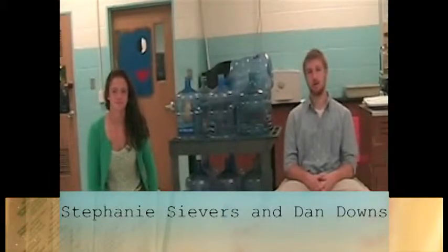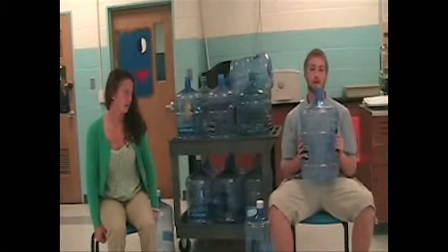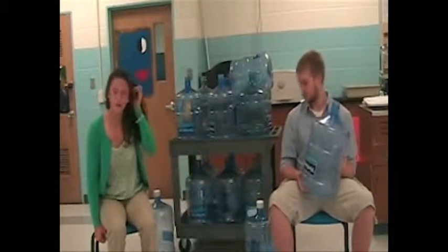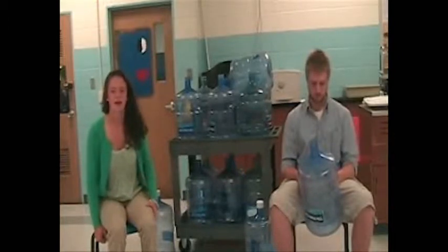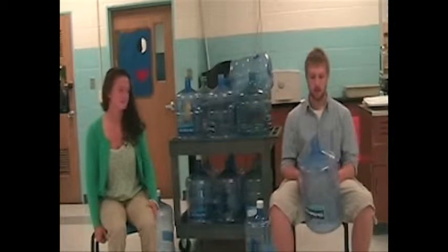We are currently working on a bioreactor project to grow algae, and we are working on the mass production phase with these 5-gallon jugs donated to us by a water company, to which we wrote a letter. To get all these, we basically wrote a letter to a local water company, and on our website we're going to be showing you the letter we sent to the company.